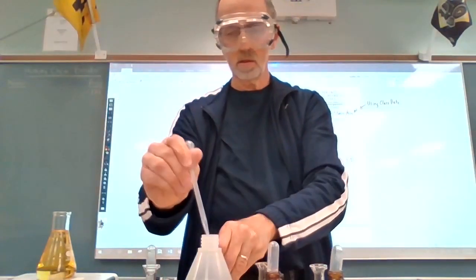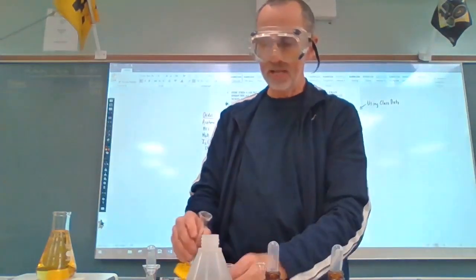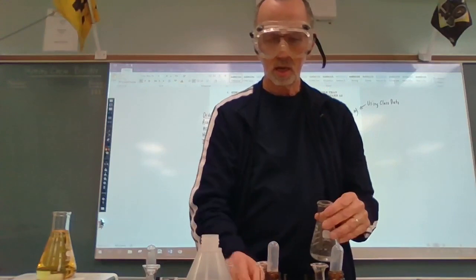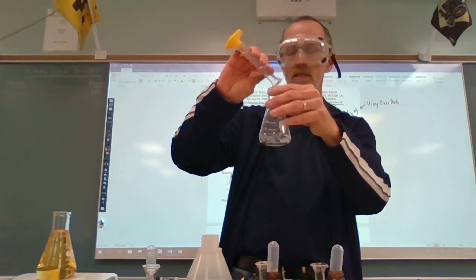Okay, I'm going to go ahead and add those in that order to our reaction beaker, or I should say our reaction flask here, Erlenmeyer flask.